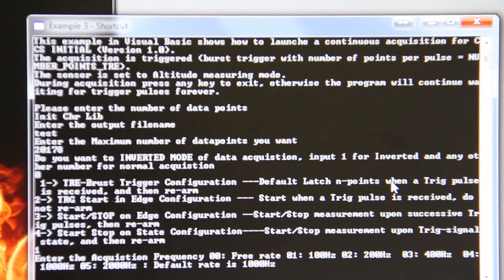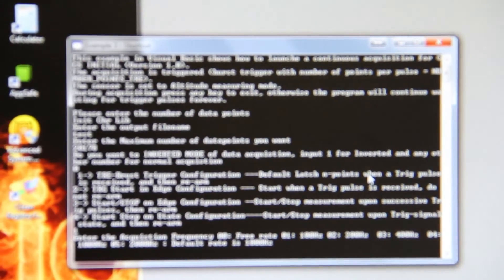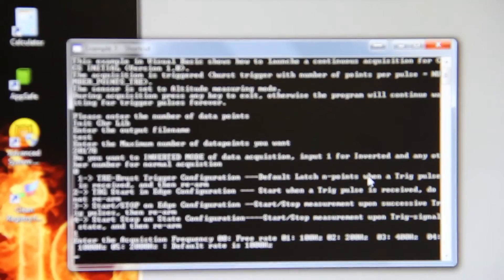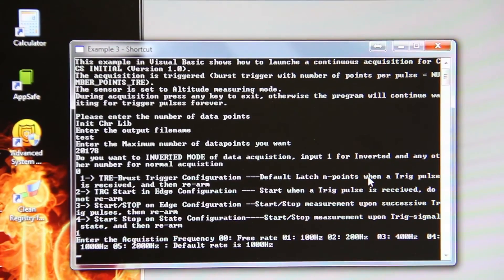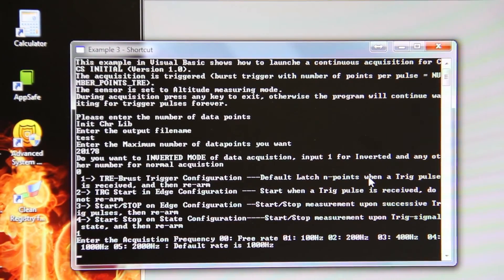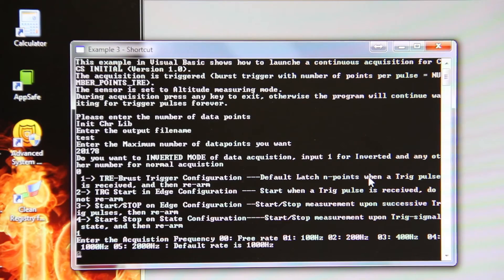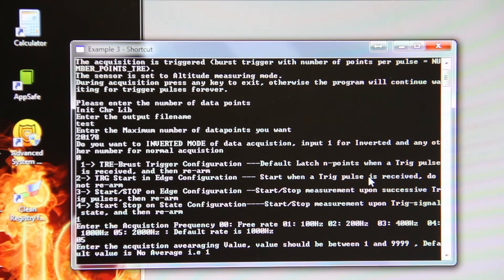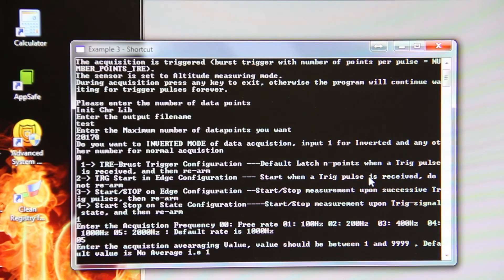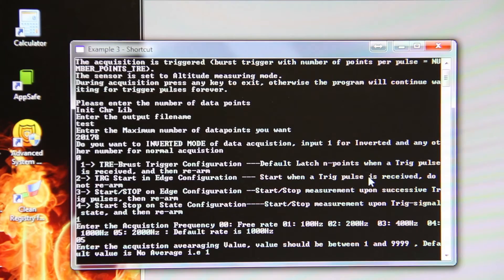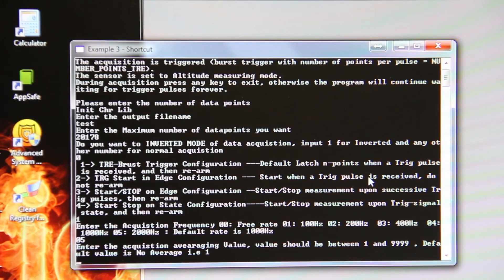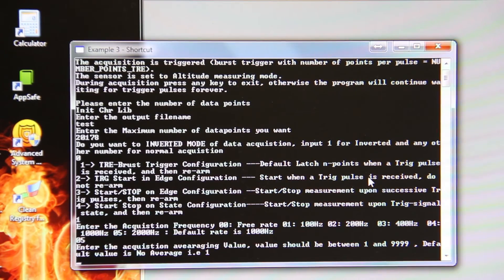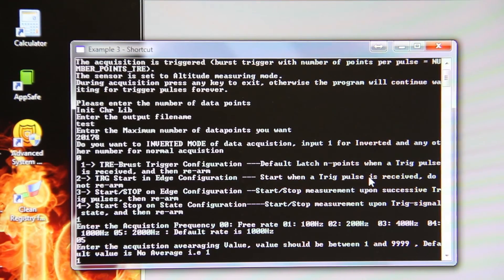Enter the acquisition frequency. So we will use 2000 hertz, so press 05. Enter the acquisition averaging value. We will not do any averaging, so press 1.